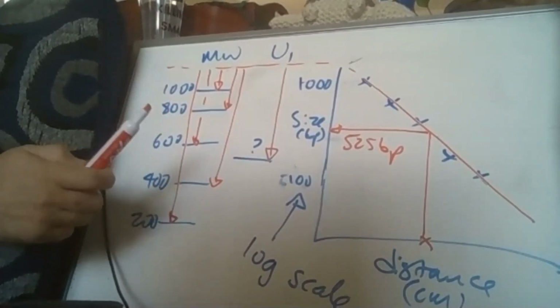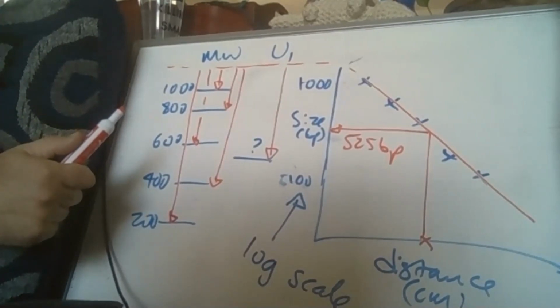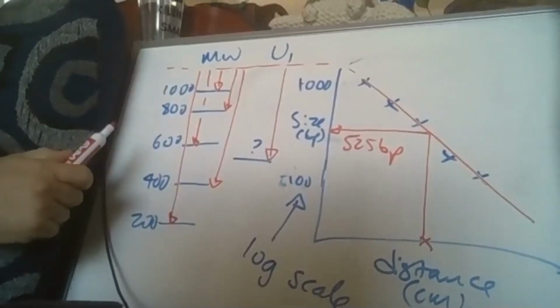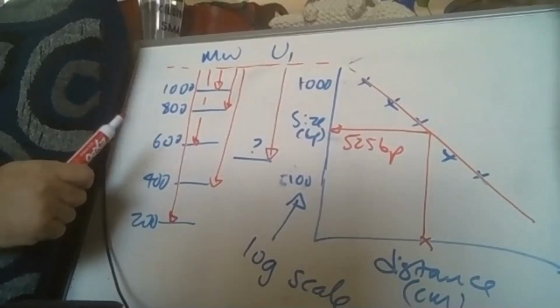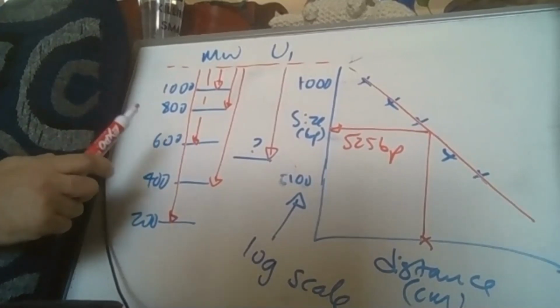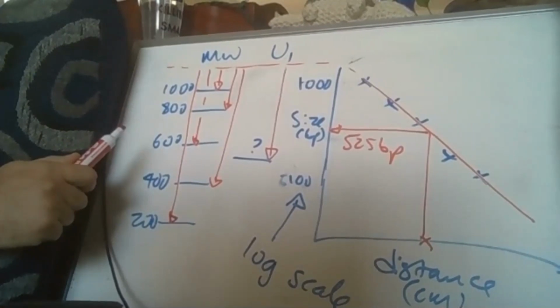So I do have a quick question, if that's okay. Yeah, for sure. I'm looking at the Promega. In total, there's 13 markers, but we only know for sure 5 of them. Are we only using those 5, or are we estimating all 13 of them? Oh no, this is just because I didn't want to write out 13 because it would be really tedious. For the Promega one, you use which ones you can clearly identify from the picture and measure accurately. So you probably don't need to do all of them, but you should do as many as you can. Gotcha. Great, thank you.